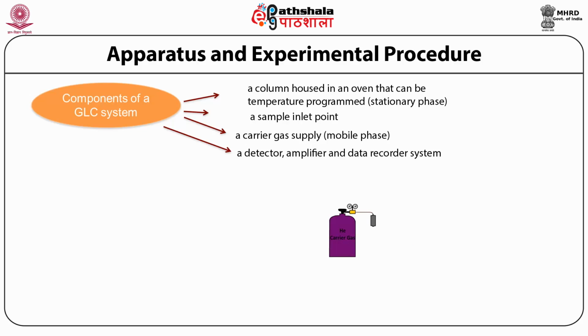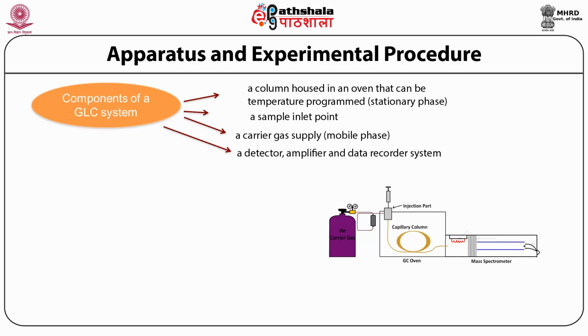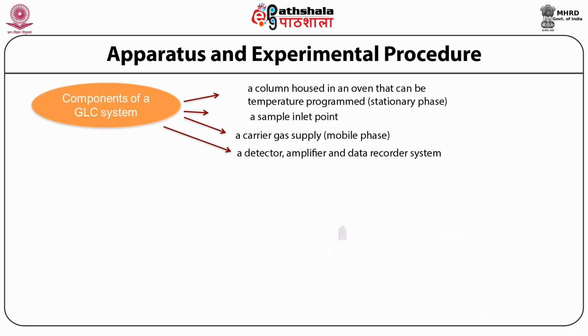And this detector, which is the mass spectrometer here, is then attached to an integrator, which is basically a computer. Once this deflection is recorded by a plate, which consists of many electrical circuits, as a result we get a mass spectrum, which is also called a mass chromatogram. And the peaks that you see here represent individual lipids in the mixture.